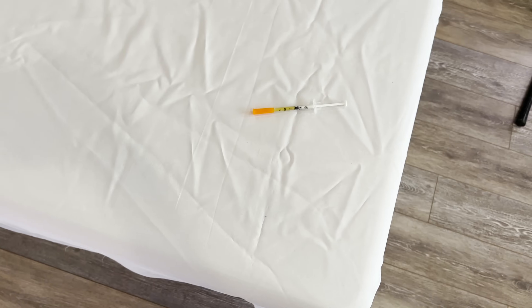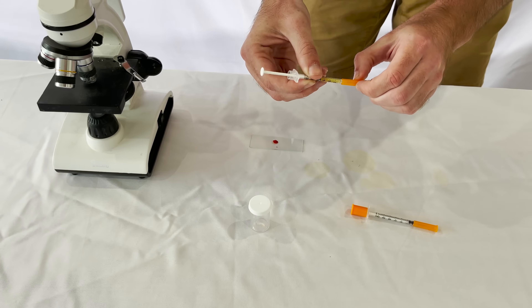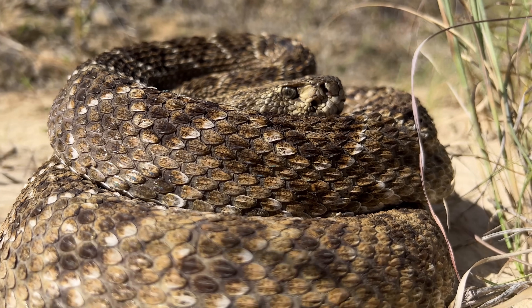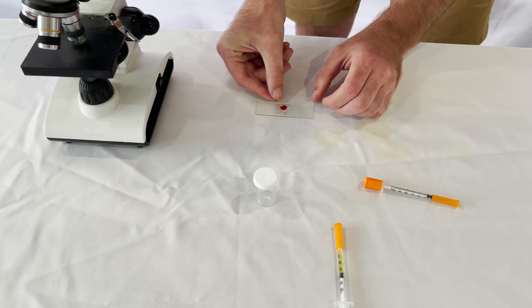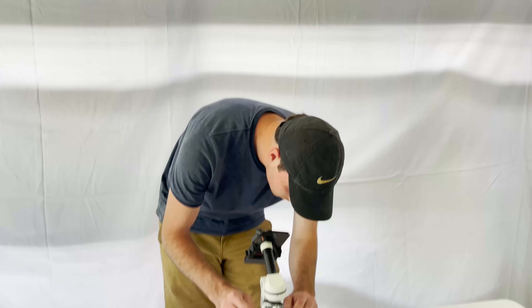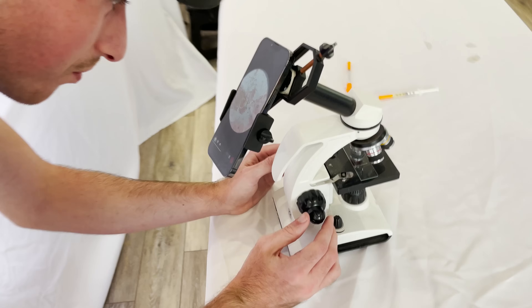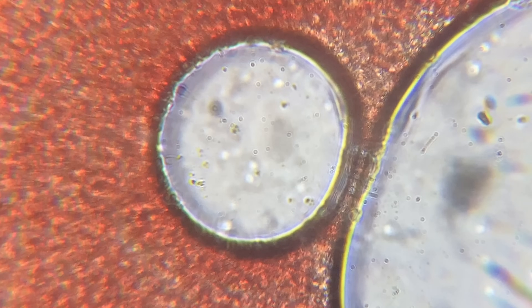Now this is the fun part. I've done venom extraction experiments before with centipedes, spiders, and copperheads. I love every excuse to bring the microscope out. Almost more than seeing these snakes in the wild, getting to see for myself just how powerful their venom is — to see it actually eat away at blood cells — is going to be so cool. It's a hemotoxin; it attacks the blood. The best way to see its action is to look at how it affects blood under the microscope. This right here is what healthy blood looks like — healthy human blood. You have the red donut-shaped cells, a relatively even distribution, still fluid, not clumping, just free-flowing on the slide.